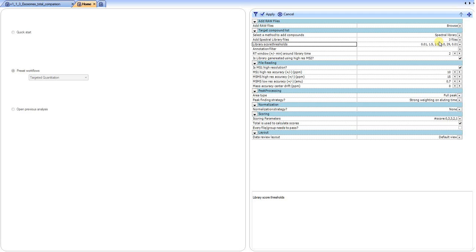In addition to the protein and peptide list, Pinnacle also reads in the charge states for both precursors and products, and the product ion distribution, which is absolutely key for scoring and increasing the confidence in evaluating your data. It reads in all of your PTMs that were identified during the search parameters. And finally, it reads in the retention time for that particular peptide.